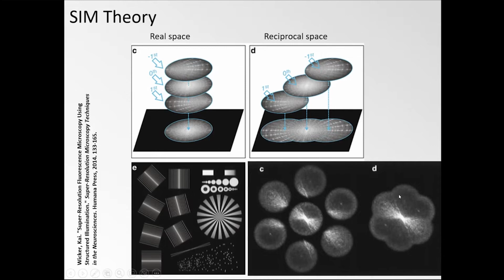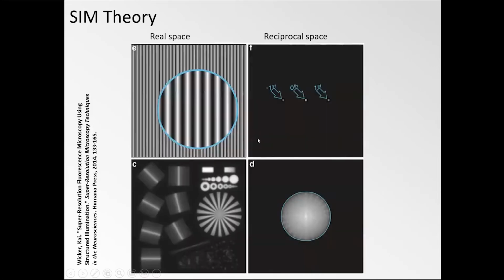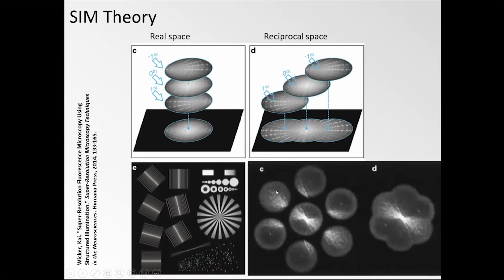And this is actually experimental data from one of the seminal papers from Mats. So there were some directional features, like I think microtubules, and they had essentially Fourier components that radiate out. So similar to that computational sample shown here, but actually done with real data. And you can see that some of these side bands carry some of these Fourier components that radiate out from the center nicely, which otherwise would have been lost.